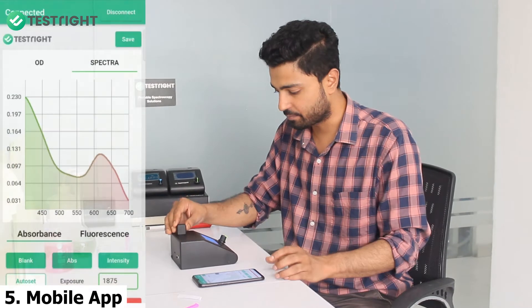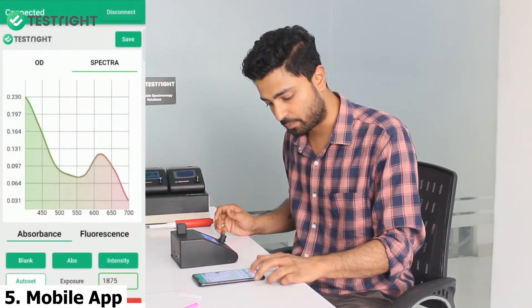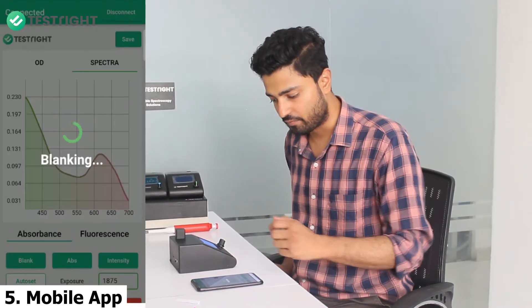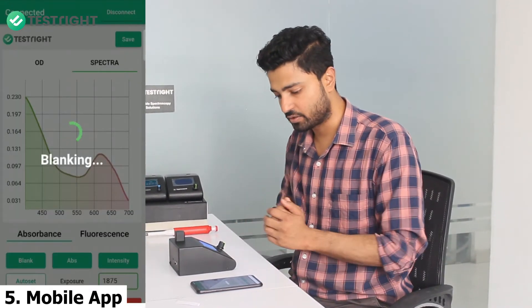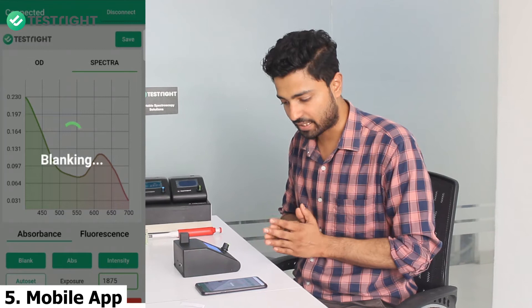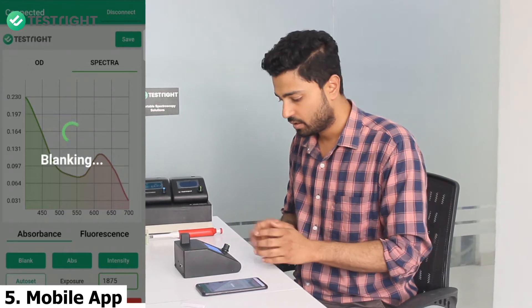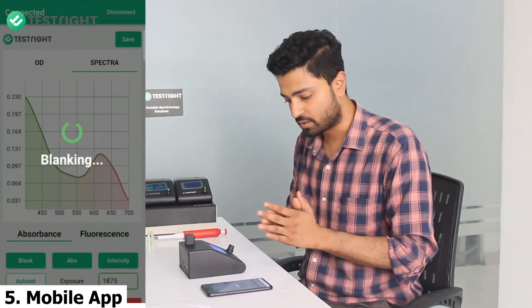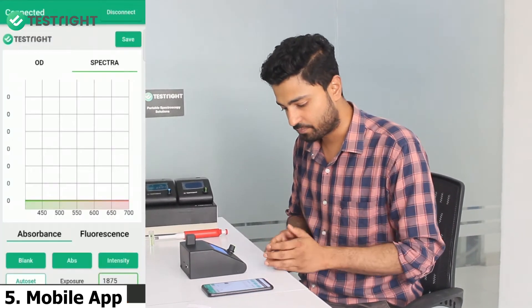I insert the blank sample and click on the blank here on the app. Within five seconds you can see the blank has been done. Both the screens are showing the same value, same message.